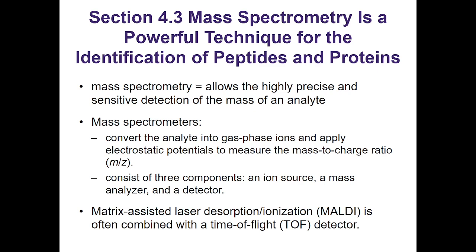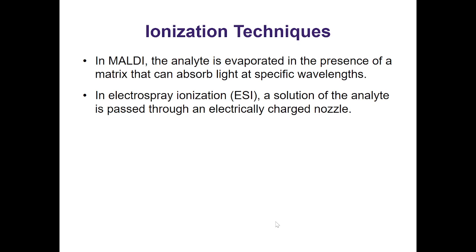You literally just plug each thing in. Gas chromatography to gas chromatography to high precision, and then to an MS, to another MS, to another MS, so you can resolve very fine differences in m/z. Okay. Yeah. Anyways, so wonderful.